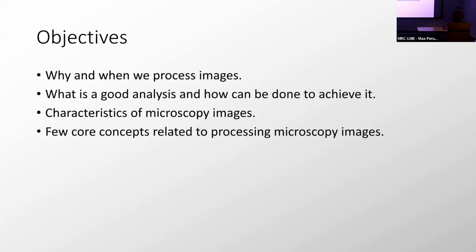So the objective of the presentation is to understand why and when we need to process images, how to achieve a good analysis, and what the steps are. We try to understand what our pictures are, how we can represent them, and how we can understand what we are looking at.